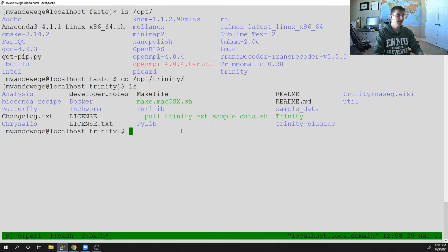I understand what's happening, but it's hard to explain, especially without drawing anything out. It gets a little tricky to try to explain. But again, the whole point is to just assemble these reads into non-redundant, unique transcripts present in this whole data set, just by finding overlapping reads that share sequence similarity, right? I mean, that's the gist of it. The computer wizardry gets way, way, way more complex. Nothing I can replicate.